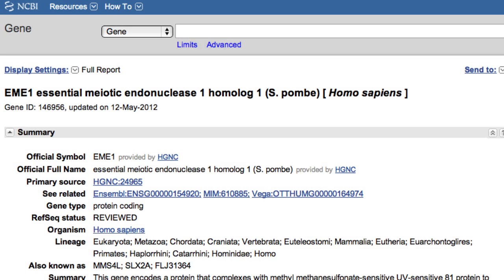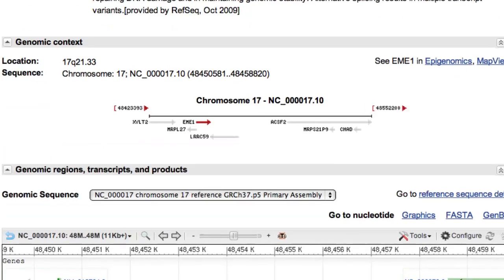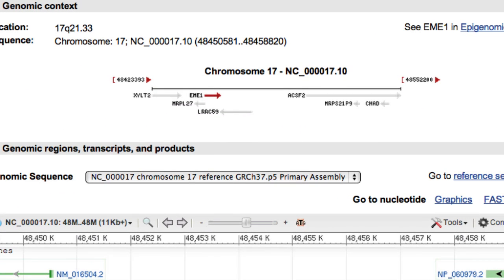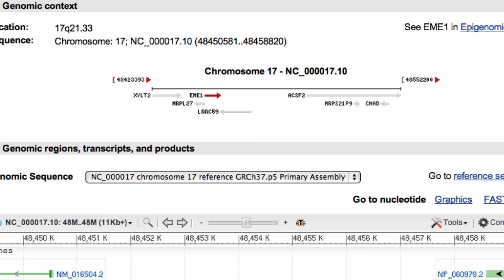You might first take a quick glance at the genomic context section. The highlighted arrow and the arrowheads point to the right, so this is a plus-strand gene relative to the chromosome 17 annotation.